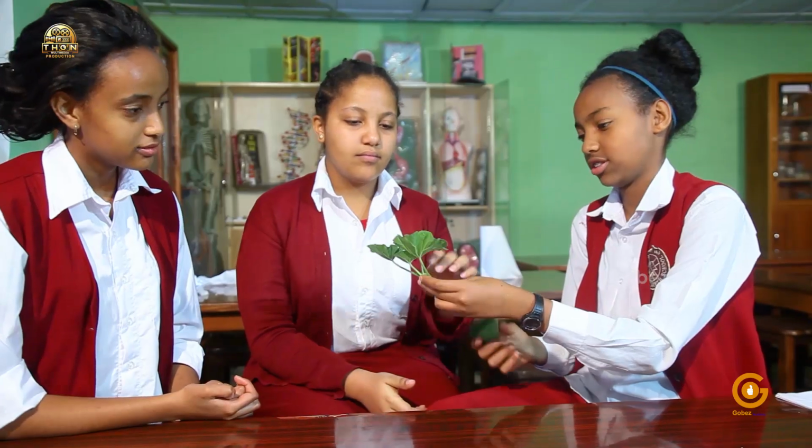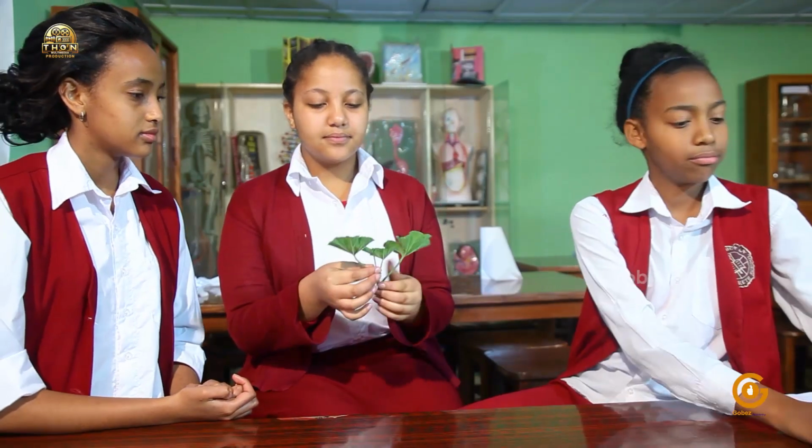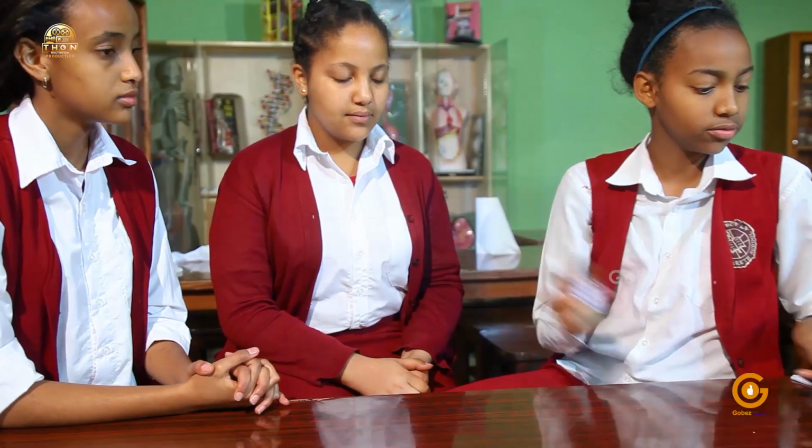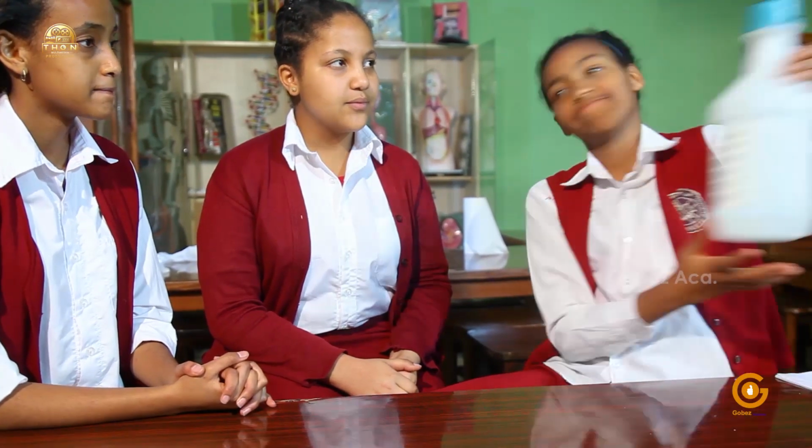For this experiment, we need the following materials. A fresh cut leaf from outside, a large beaker, a hot plate, iodine solution, this is iodine, and ethanol.